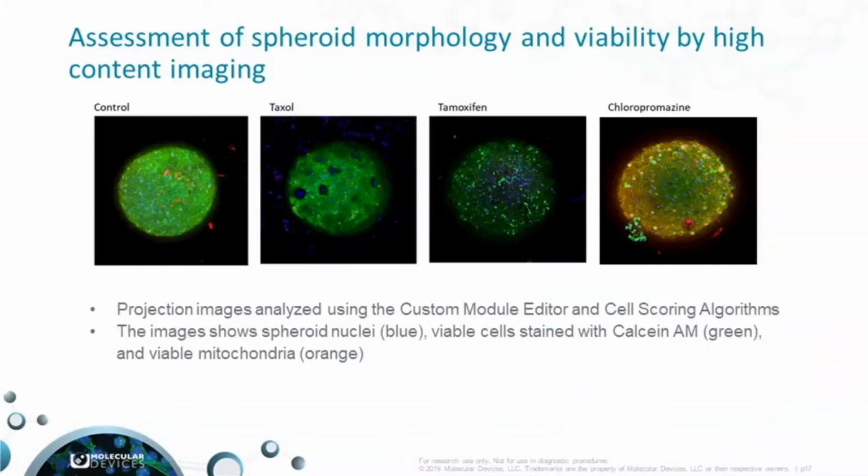And these were also further analyzed, and we used some cell scoring algorithms to generate these images. And again, this work was done by Oksana Sarenko, who is our senior scientist in our group for working with both the cardiomyocytes as well as the microbrain and other neural spheroids in the group.